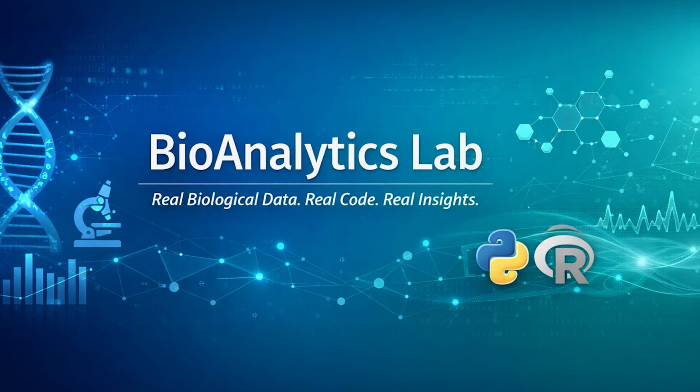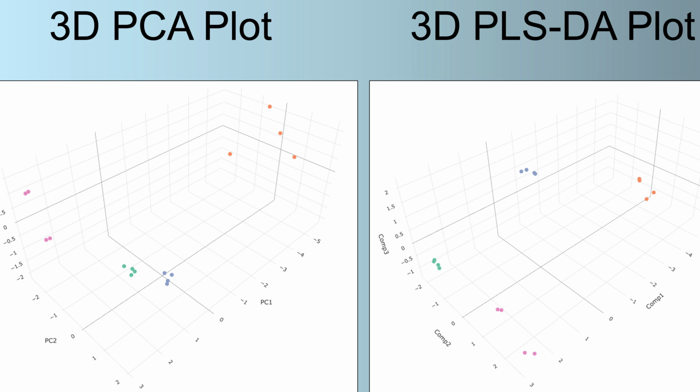You will learn practical workflows in metabolomics, proteomics, bioinformatics, and statistical analysis that you can apply directly to your own research. In this video, I will show you how to generate PCA and PLS-DA plots for metabolomics data using R. We will go step by step, starting from loading and preparing the data frame, preprocessing the metabolomics data, running PCA and PLS-DA analysis, and finally creating 3D interactive plots.